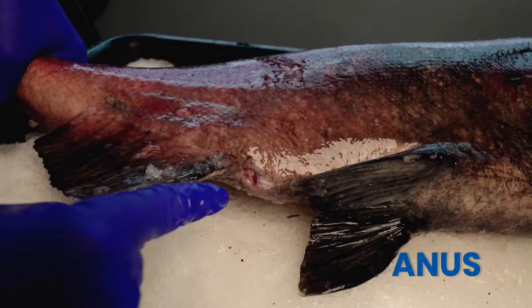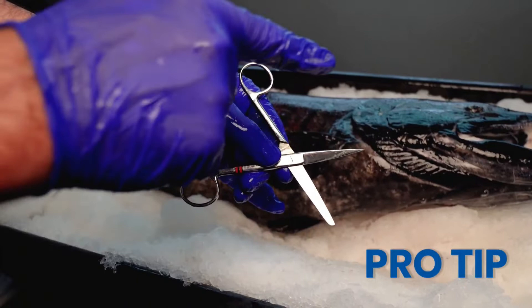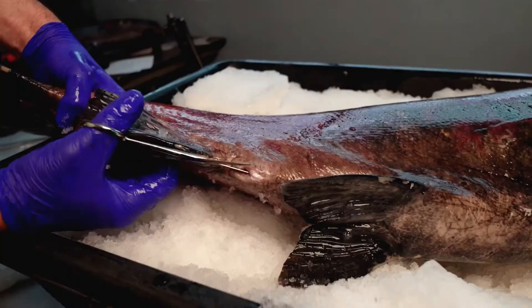For those of you doing your own fish dissection, here's a pro tip: be sure to use the blunt edges of the scissors when cutting into the body cavity. This prevents organ damage.